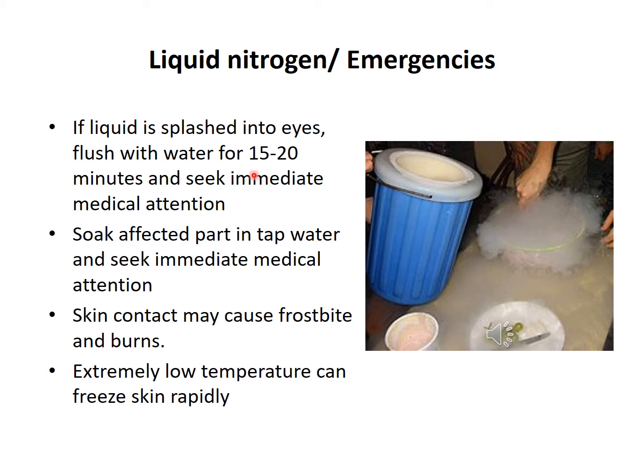So go ahead and wash your eyes for 15 to 20 minutes continuously, okay? And then of course seek immediate medical attention at the hospital, okay? And of course, even if some drops of liquid nitrogen fall on your hands, put your hands or the affected area under continuous running water, okay?